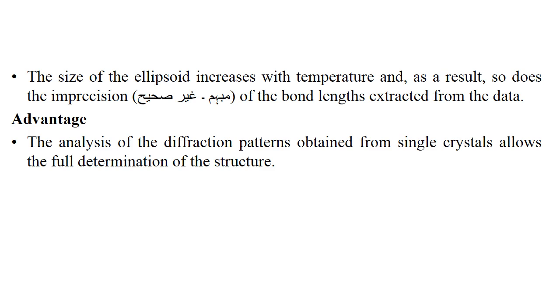The advantage: analysis of the diffraction pattern obtained from single crystals allows the full determination of the structure.